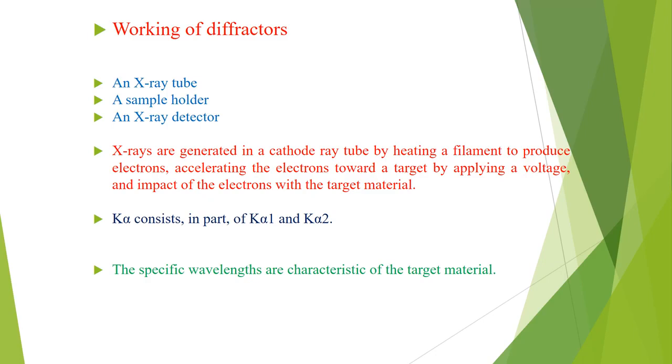So here is the working of the diffractometer, in which three basic elements, the X-ray tube, sample holder and X-ray detector, are used.